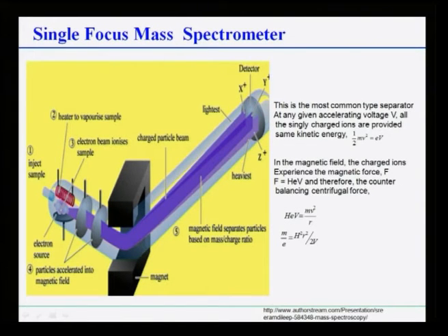This particular slide is on the single focus mass spectrometer. This is a very simple technique. This schematic picture is taken from a presentation available on the website. What is done here? Let me first explain the theory. This is the most common type of separator.